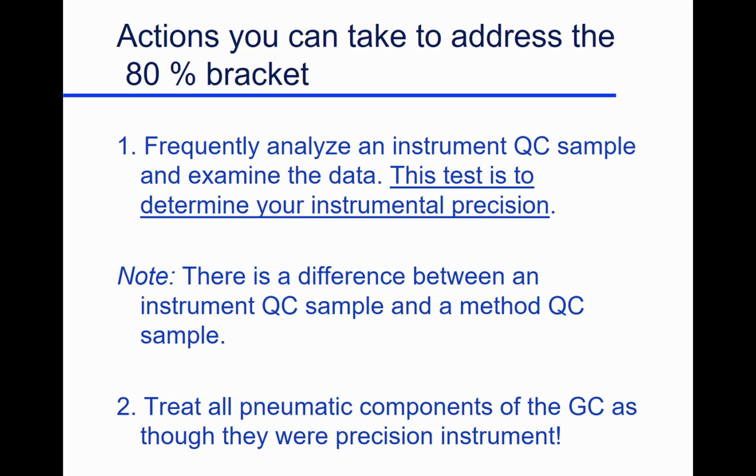The instrument tells you when a peak is coming, and it tells you, oh, I'm starting to count that peak. I'm starting to measure. It gives you a little blip. It gives a peak, and then it gives you another blip. Oh, I stopped measuring that peak. Now I've gone on to something else. And they go through every one of those chromatograms, every one of the peaks, every one of the compounds they're analyzing. They look and say, did the instrument make the right decisions?